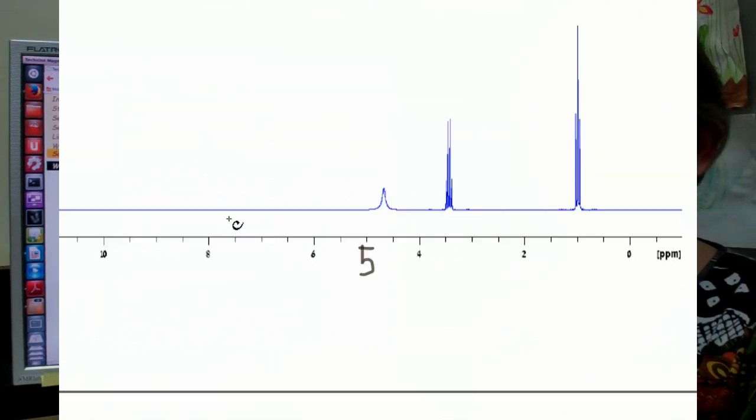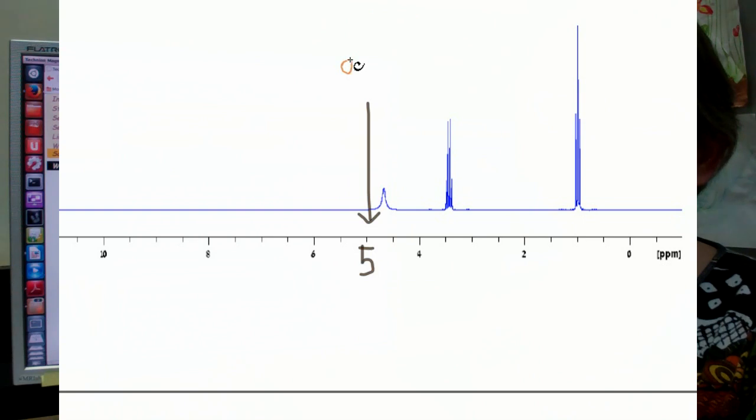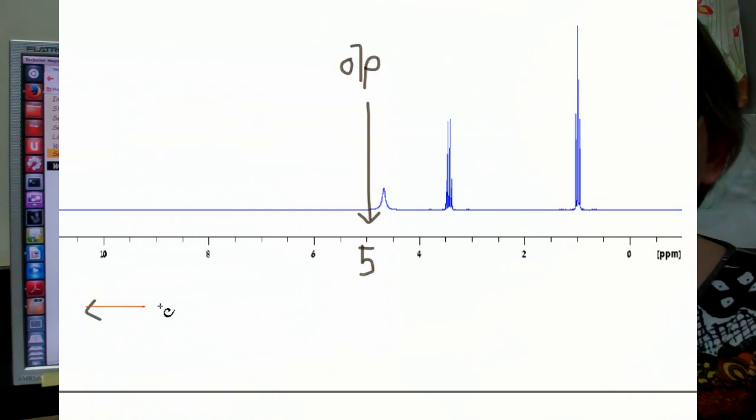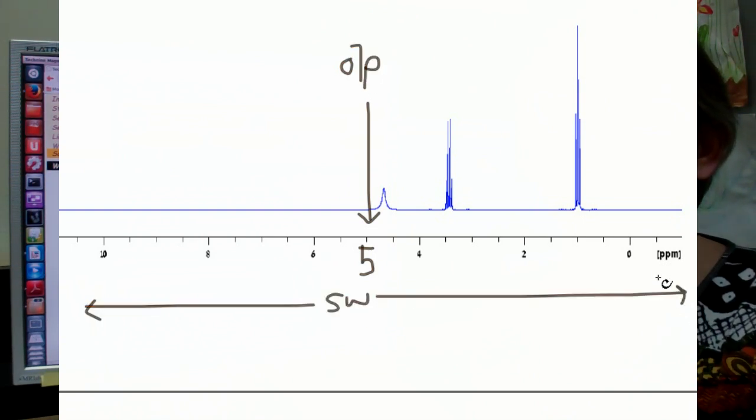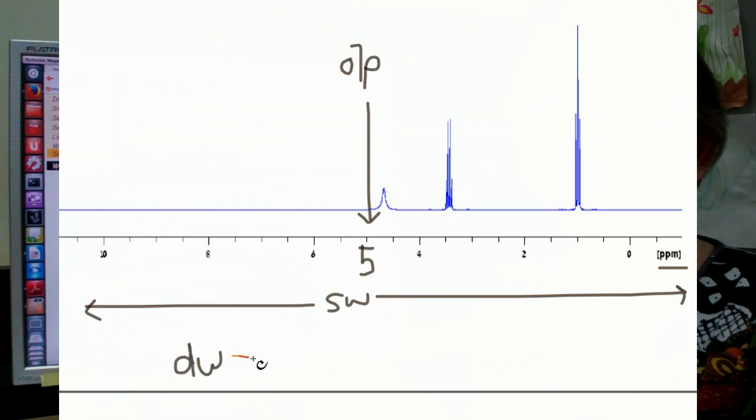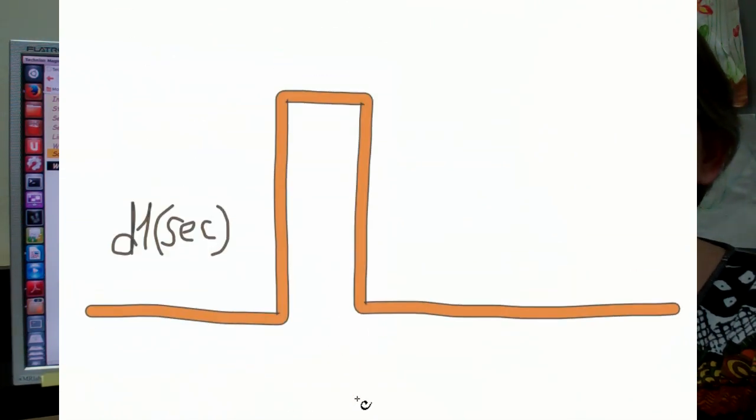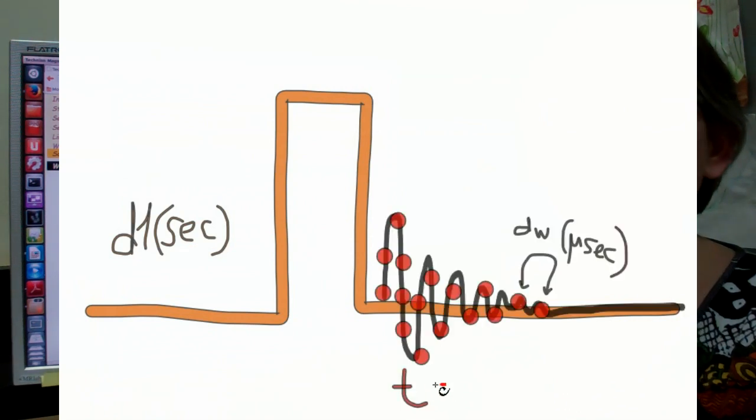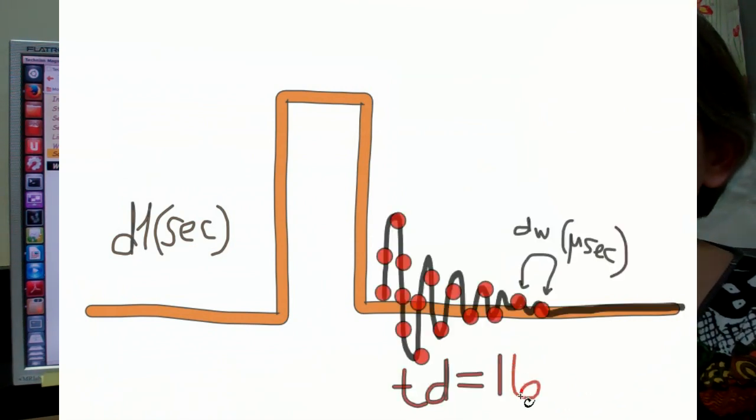Number 2, O1P, which sets the center frequency of your spectrum. Number 3, SW, which sets the spectral width in ppm. This will automatically determine DW, the digitization rate, according to 1 over twice the spectral width in hertz.